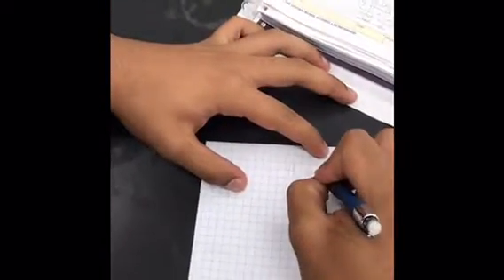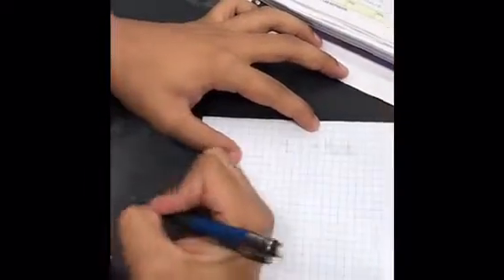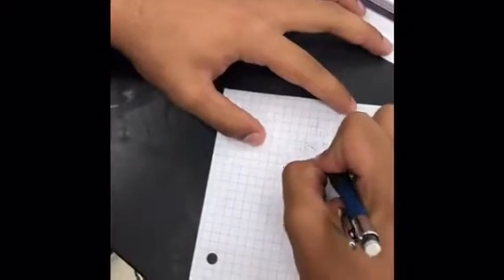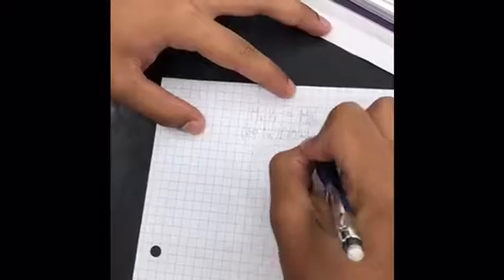This formula says the initial concentration times the initial volume that we're using is equal to the final concentration times the second volume. For our first concentration, it's 20% stock, as I said before. And our first volume is going to be 10 milliliters that I take from the pipette.